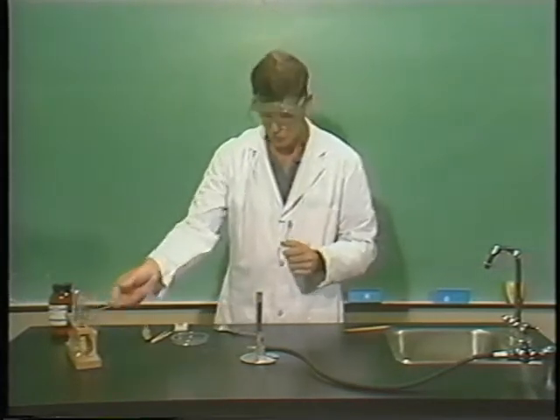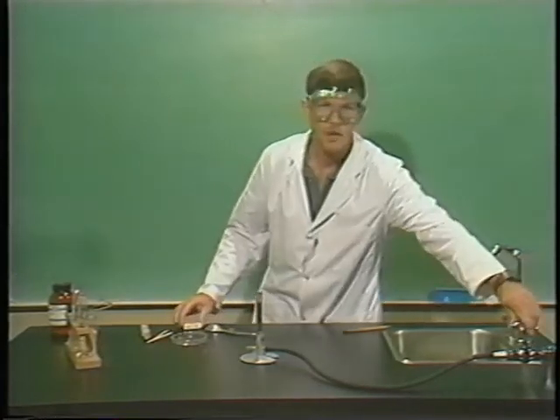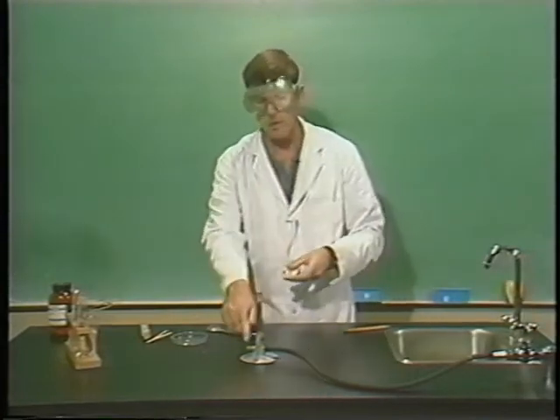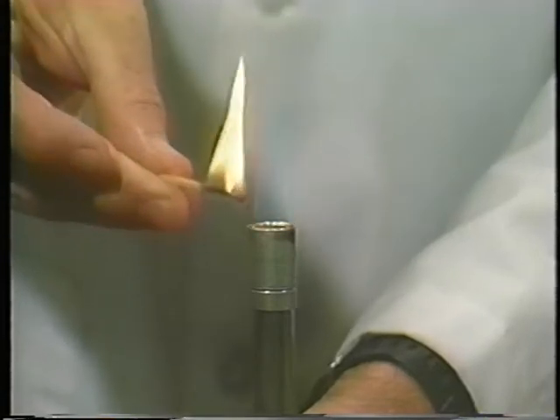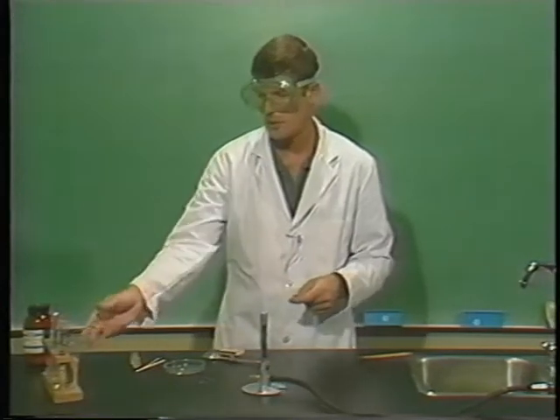Now, what we're going to do first is light up this Bunsen burner. And once again, it's important to start by controlling the main Bunsen burner gas with the main valve and then adjust the other valve if you have one. So we'll light it up now. Once the Bunsen burner is adjusted, we're ready to do the experiment.